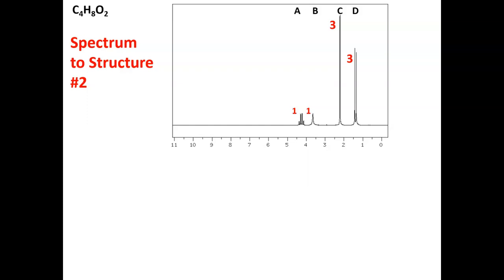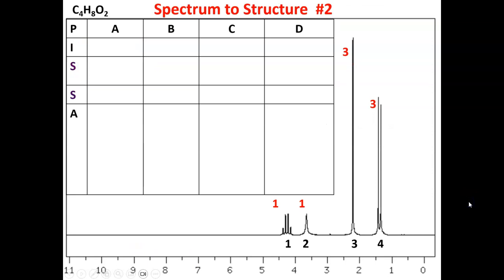So in the first slide, you're going to see my attempt at the table, and here it is. I've kept the size of the spectrum as big as I can so that we can see data and information clearly. And I've made the table using the initial letters of the headings: peaks, integration, shift, splitting, and assignment, so that we can fit the table in.